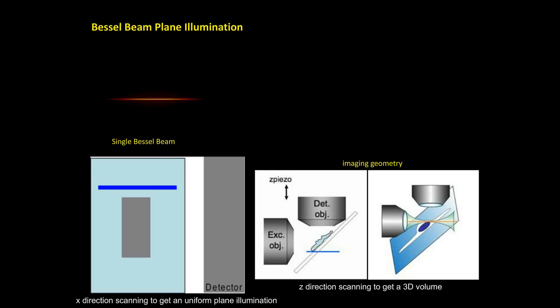As you can see in this intensity plot, there is a frequency. This frequency can be applied to your sample, and your sample will be modulated by this excitation pattern. Once modulated, we can rotate the excitations, get a lot of exposures, and reconstruct a super resolution image. You can see here a cell with a two-color label, H2B and microtubules. This is 3D super resolution imaging based on Bessel beam excitation.